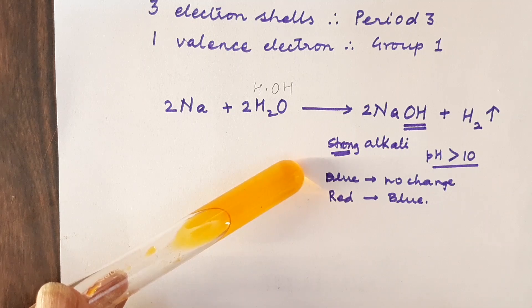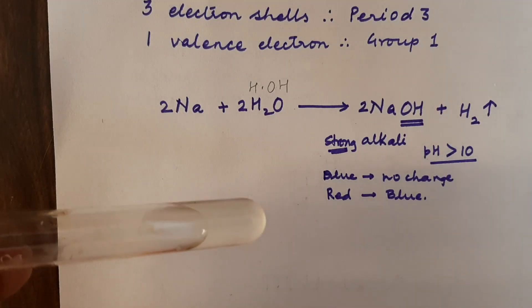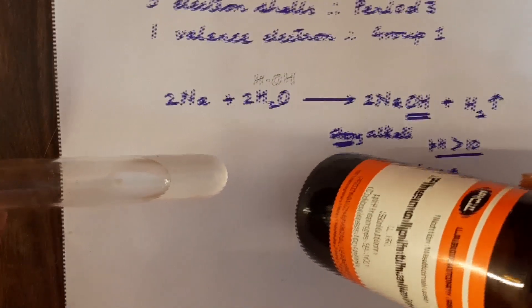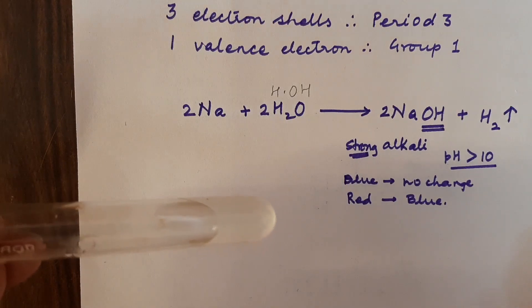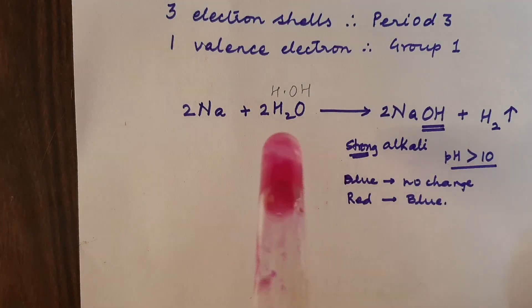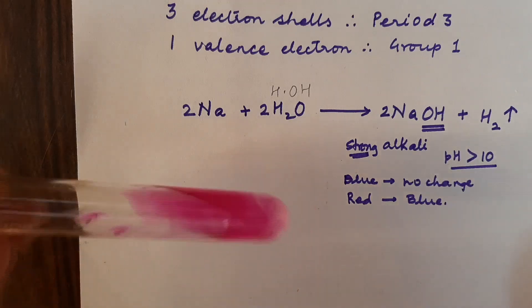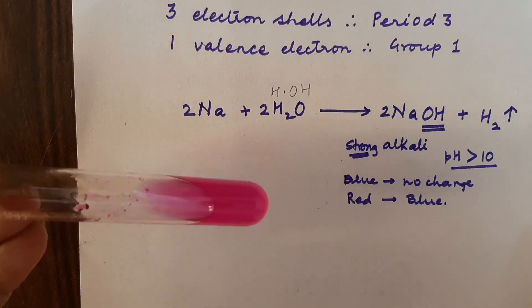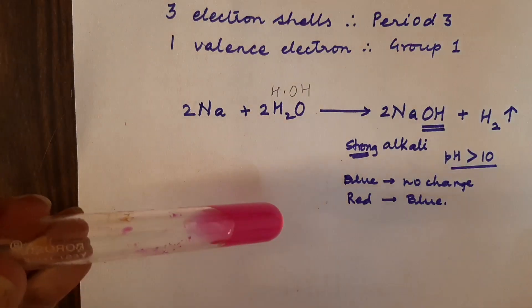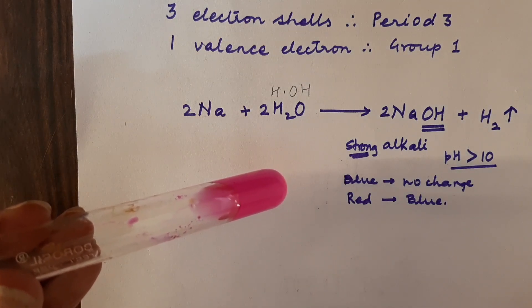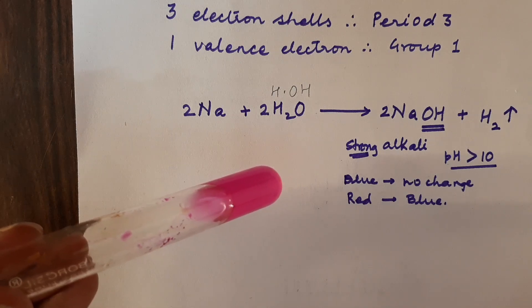Now let us try with phenolphthalein. I will take another test tube. Phenolphthalein is a colorless indicator — I am taking just a drop and adding it to the solution. See what has happened? It has turned pink. Phenolphthalein turning pink confirms the presence of hydroxyl group, and hence it is an alkali.